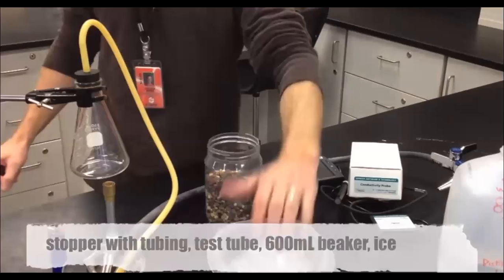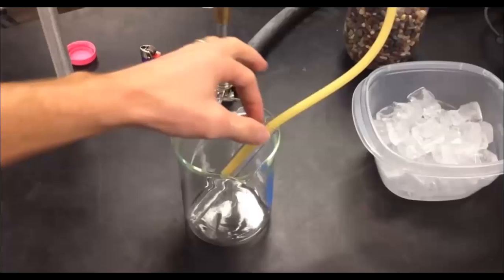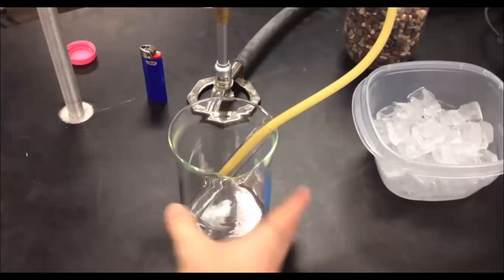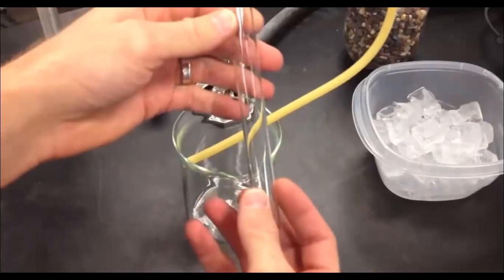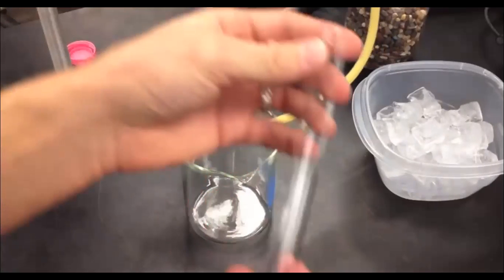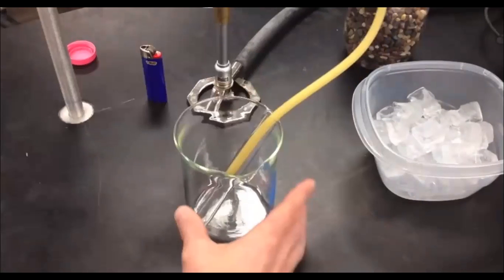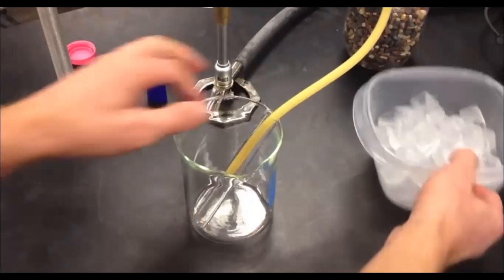Make sure that the rubber tube is going to travel continuously down without having a bend or a kink in it where the water can start to build up. That can be kind of dangerous, so make sure it's a normal line going all the way down into a test tube. This test tube has to be extremely clean because you're going to be collecting clean, pure distilled water, so make sure that this is very clean. If not, make sure to rinse it out a bunch of times with distilled water and collect it in a 600 milliliter beaker that contains an ice water bath.